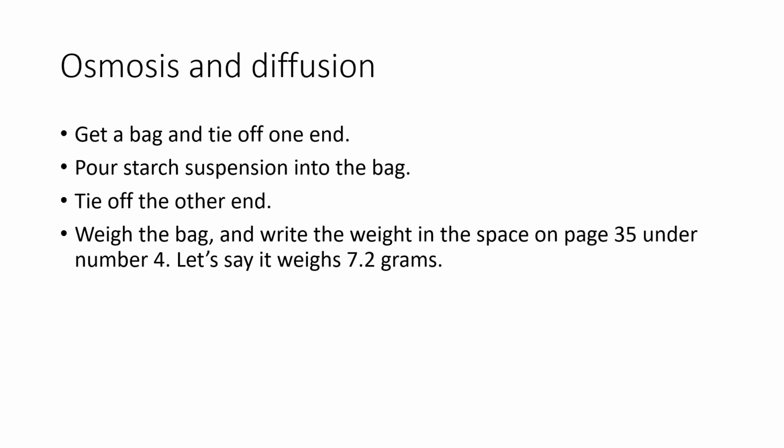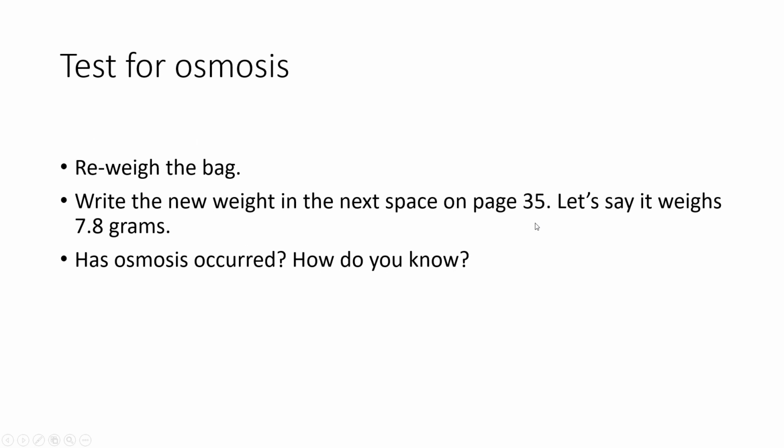What we would do then is we would let that sit for 30 minutes to an hour, and then we would continue on through this, but since we're not actually doing this together, we're just going to go ahead and move to, it's been 30 minutes, yay! We would reweigh the bag after pulling it out of a beaker of water. So now, skip down just a little bit, and it says, what is the weight again? This time our bag is going to weigh 7.8 grams.